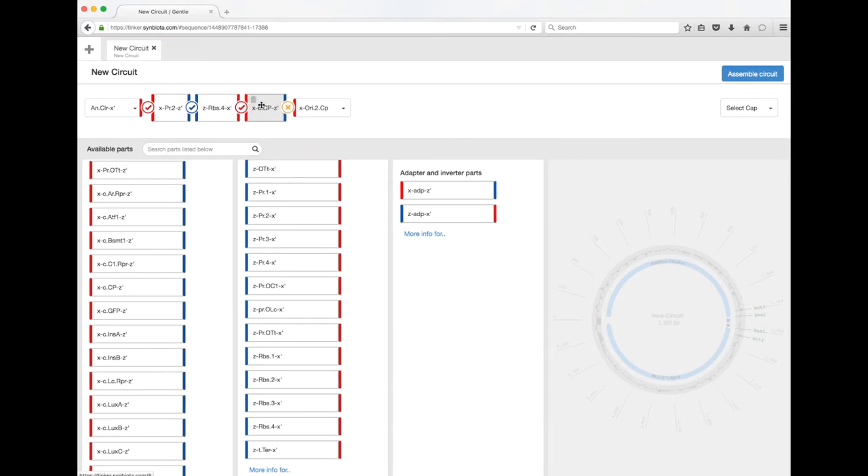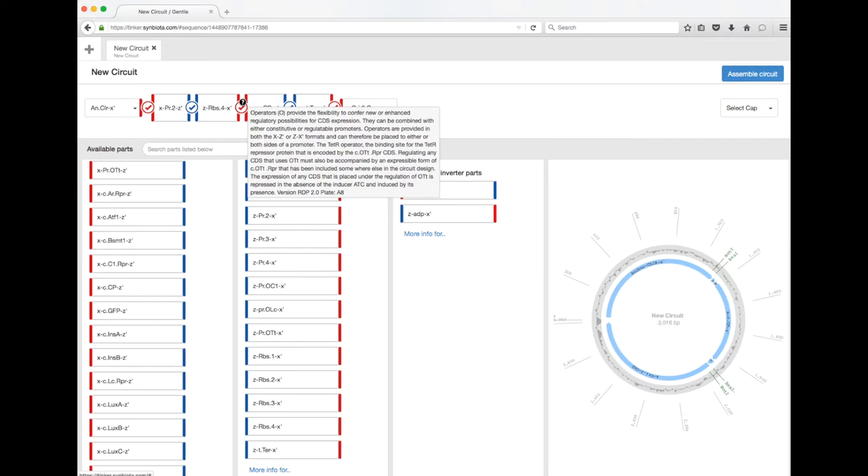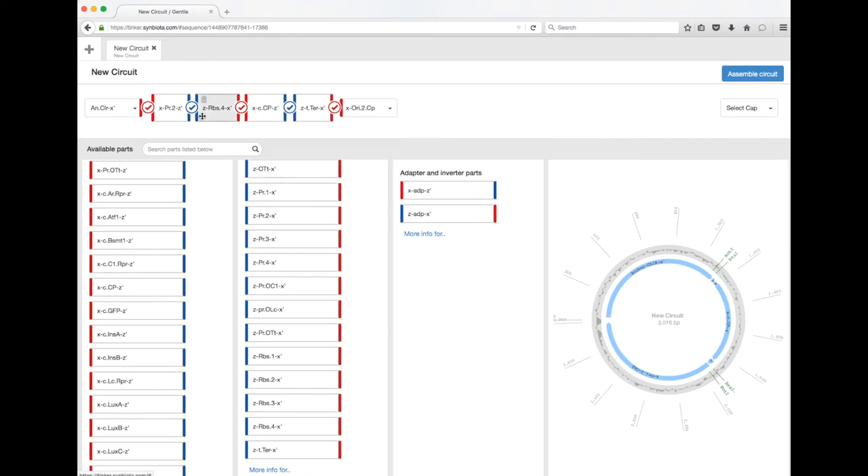The terminator prevents leakiness, helps you control and maintain an insulated program, and prevents the machinery from running past into any adjacent programs or other sections. Adding a terminator is optional, but it's good practice. That's a complete circuit that will make the bacteria blue in color when you grow it on a chloramphenicol-containing agar plate.